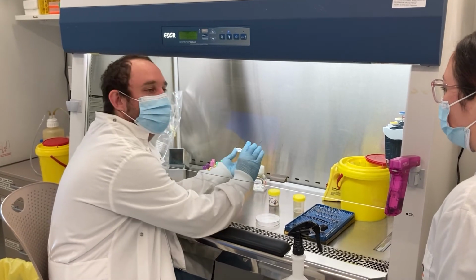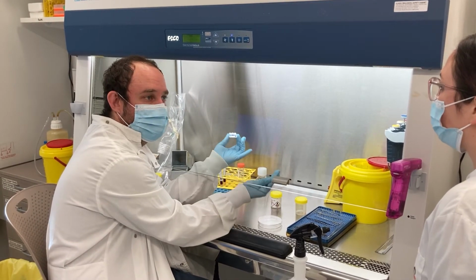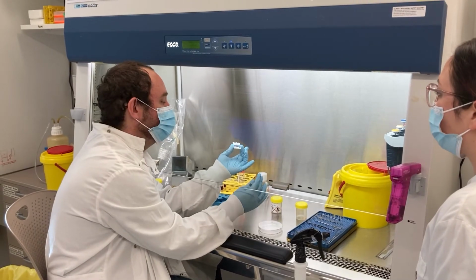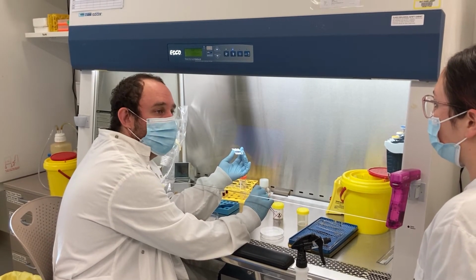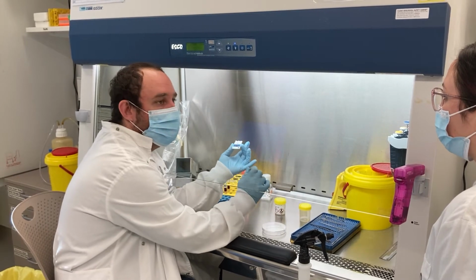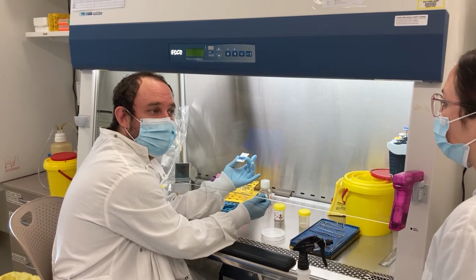And we put those slices on tissue sponges in culture. What the sponges do is they absorb the media and the drugs, so they provide this really interesting air-liquid interface. And we can rapidly cut sections, treat them for 6 days in drugs, and have a look at the way the cells are afterwards. So we stain them for markers that are either alive or dead. And we say, well, chemotherapy has done this to the tumour cells. Immunotherapy has done this to the tumour cells.